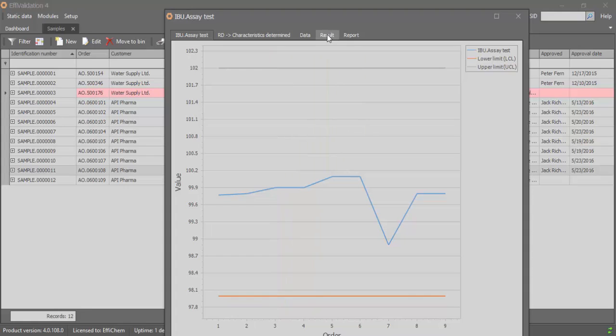One of the other things that this trending function does is it gives you a sigma number. Now this corresponds roughly to the concept of 6 sigma, graded accuracy information, which helps you understand more effectively how your quality is shaping up in the lab. We've learned that improvements of only 1 sigma in quality over the course of lab data can have 15 to 25% improvement in overall laboratory revenue. That's not just quality based, that's overall.